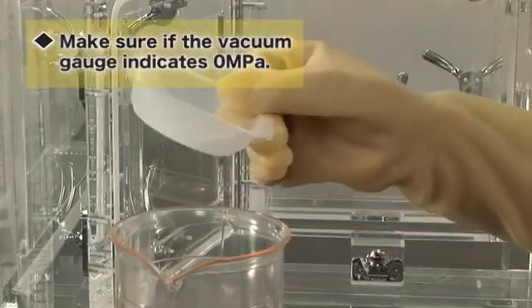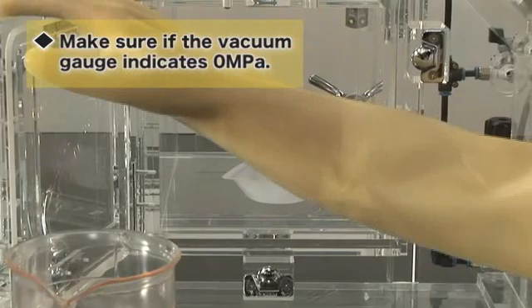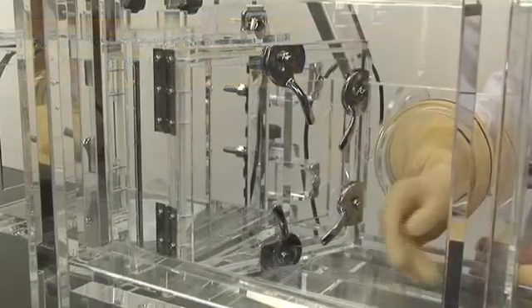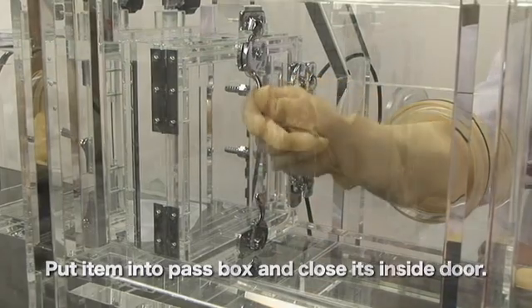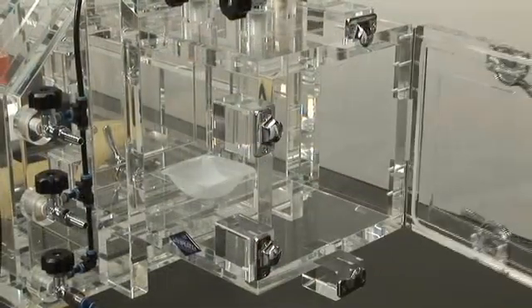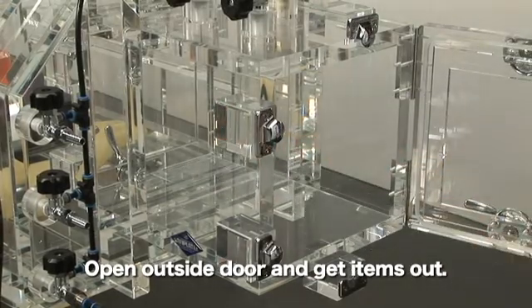When taking out items, after making sure that the vacuum gauge indicates zero megapascals, put the items into the pass box and close its inside door. Next, open the pass box's outside door and get the items out.